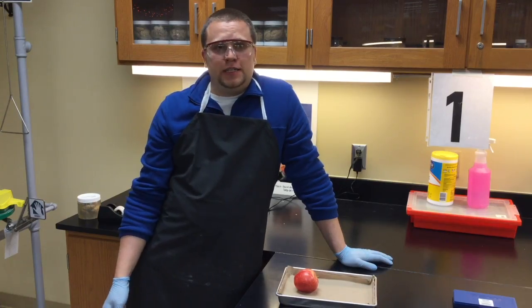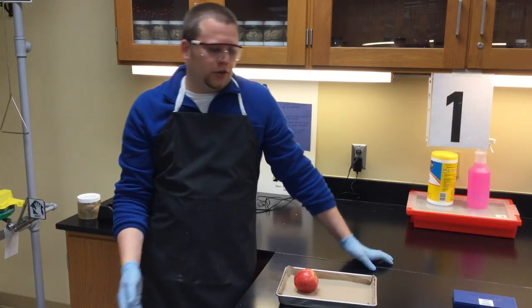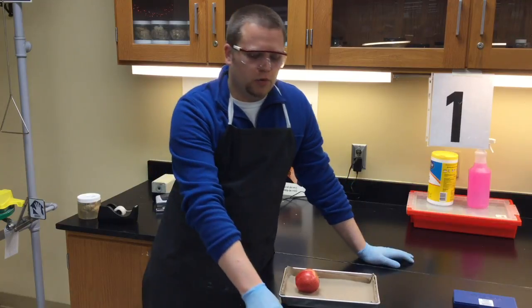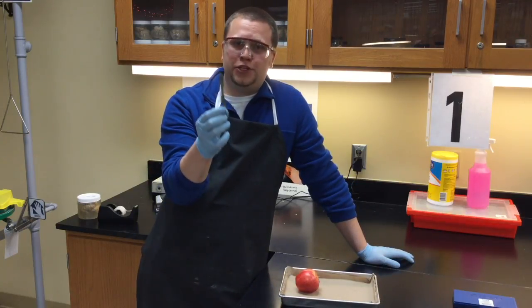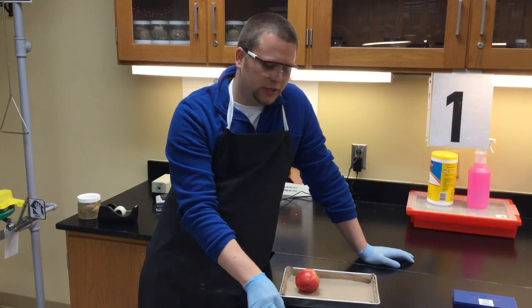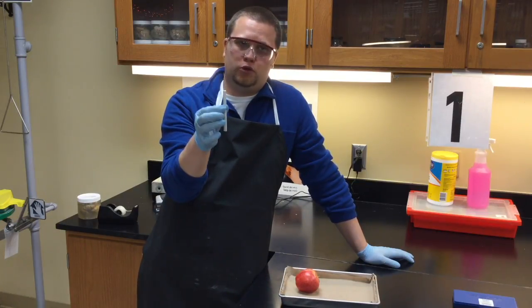To get started with your dissection, there's a few things that you're going to need. You're going to need a dissecting tray that you're going to put your specimen into. You are going to need a scalpel. Make sure you're very careful handling this because it is sharp. And the last thing you're going to use is called a dissecting probe.